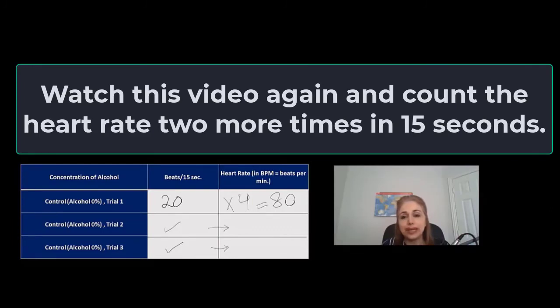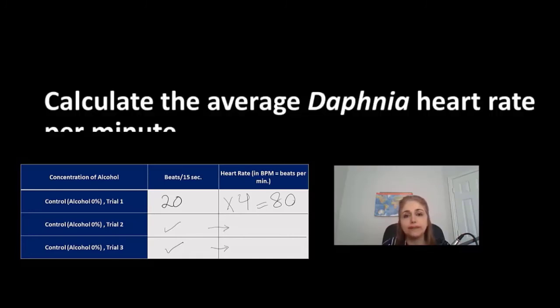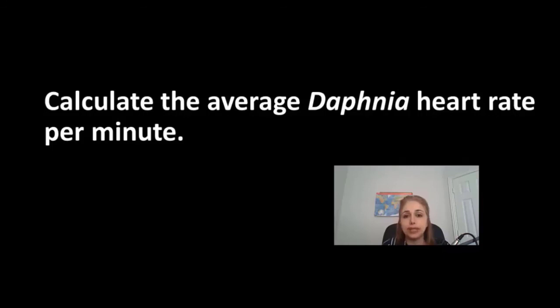Watch this video again. Count the heart rate two more times in 15 seconds, and then calculate the average Daphnia heart rate per minute and complete your data sheet.